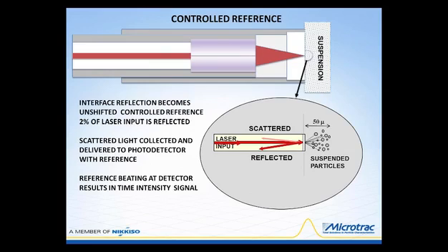The important aspect of the interface is that there is also a reflected beam. Regular optics tells us that when there's an index of refraction difference between one media and another, that interface will have a reflected component.